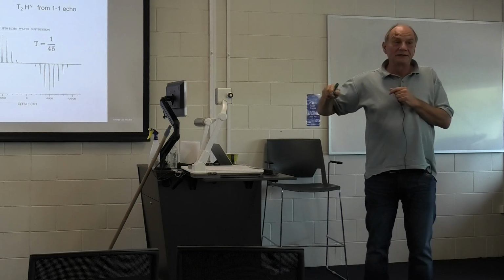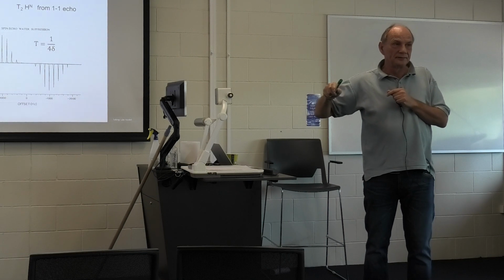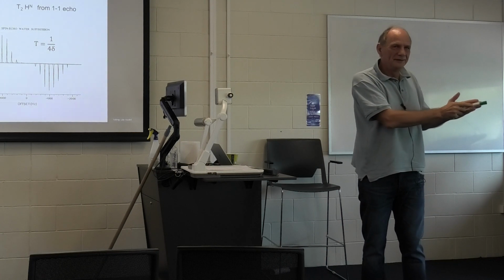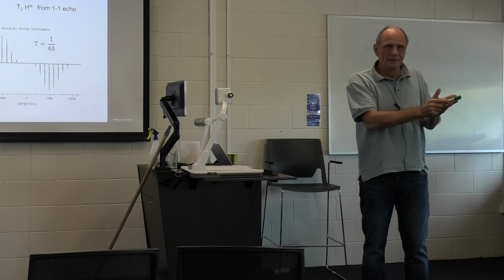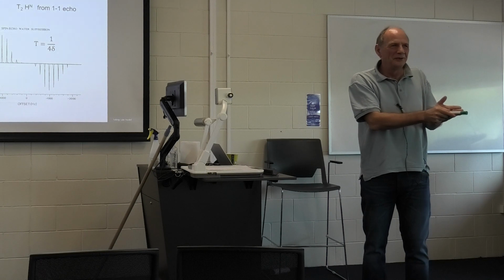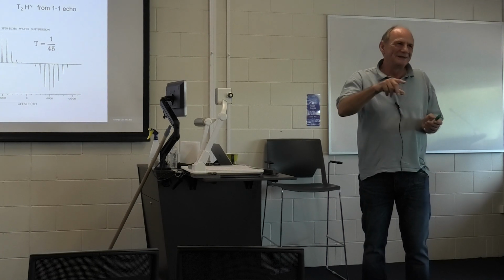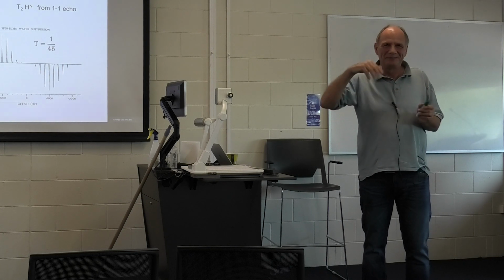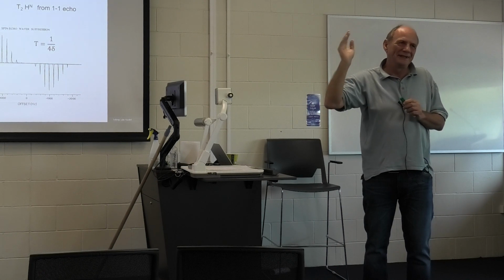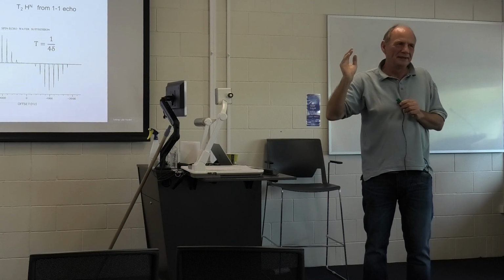And now you wait for this delay capital T. But your carrier is on water, so relative to the carrier, the water spin does not move. So you just stay on minus Y, right? Then you apply a second 90-degree minus X pulse. So minus X on minus Y is probably plus Z. Just going back to that. Yeah. So on the water, nothing has happened, ideally.